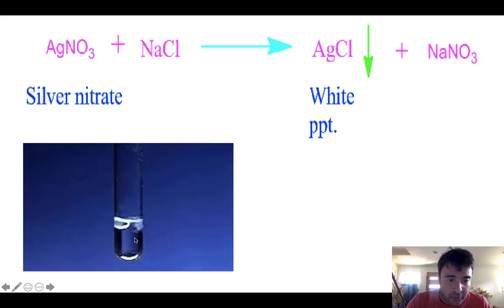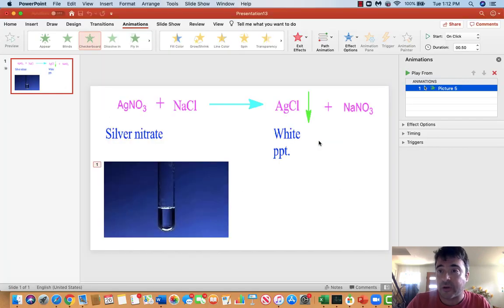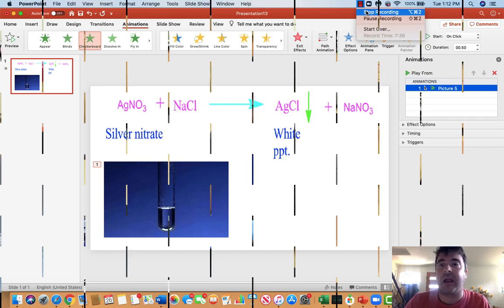So when you look at this reaction, this little GIF, before you drop the silver nitrate in, mark the color. So before, completely clear. Drop the silver nitrate in, that silver reacts with that chloride, forming silver chloride, right? That silver chloride is not soluble in water, so it's going to drop out as this white precipitate, and it's a very obvious reaction that takes place if you have sodium chloride present in this solution. So that's it until we get into the lab.